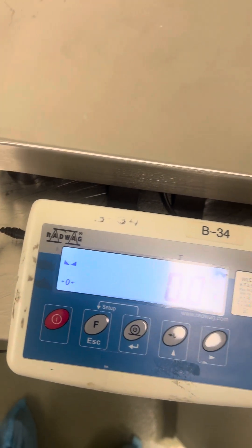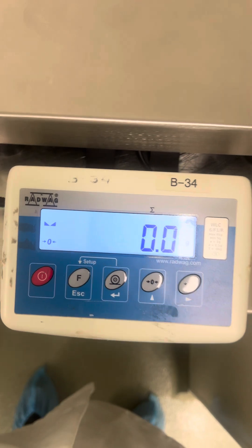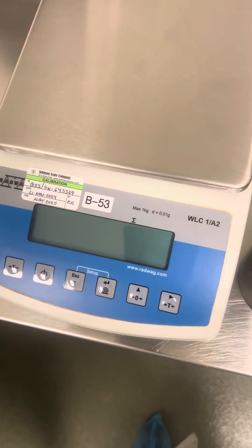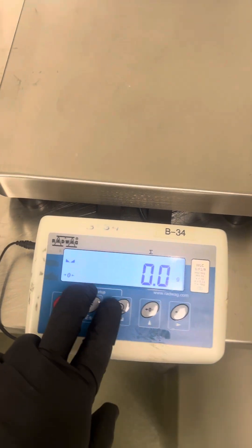Alright, so this is a calibration adjustment of a Radwag WLC, similar to the same model with different capacity, but this one is different on how it shows when you press these two keys.